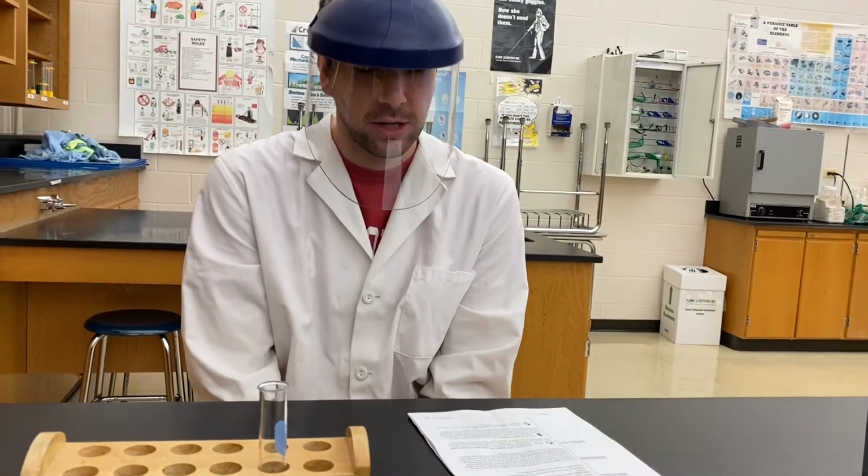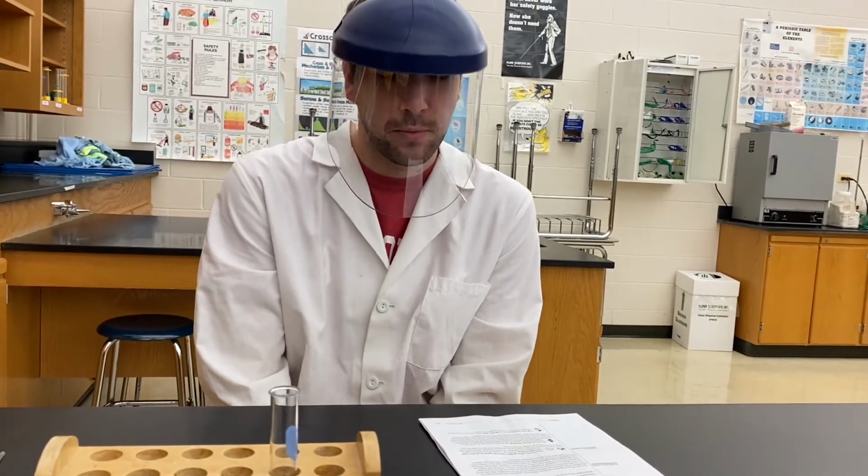Hello, Honors Chemistry. Today we are going to be doing the Evidence of Chemical Change lab. To start us off, I want to read to you the introduction on the lab. One way of knowing that a chemical change has occurred is to observe that the properties of the product are different from those of the reactants. The new product can then become a reactant in another chemical reaction.